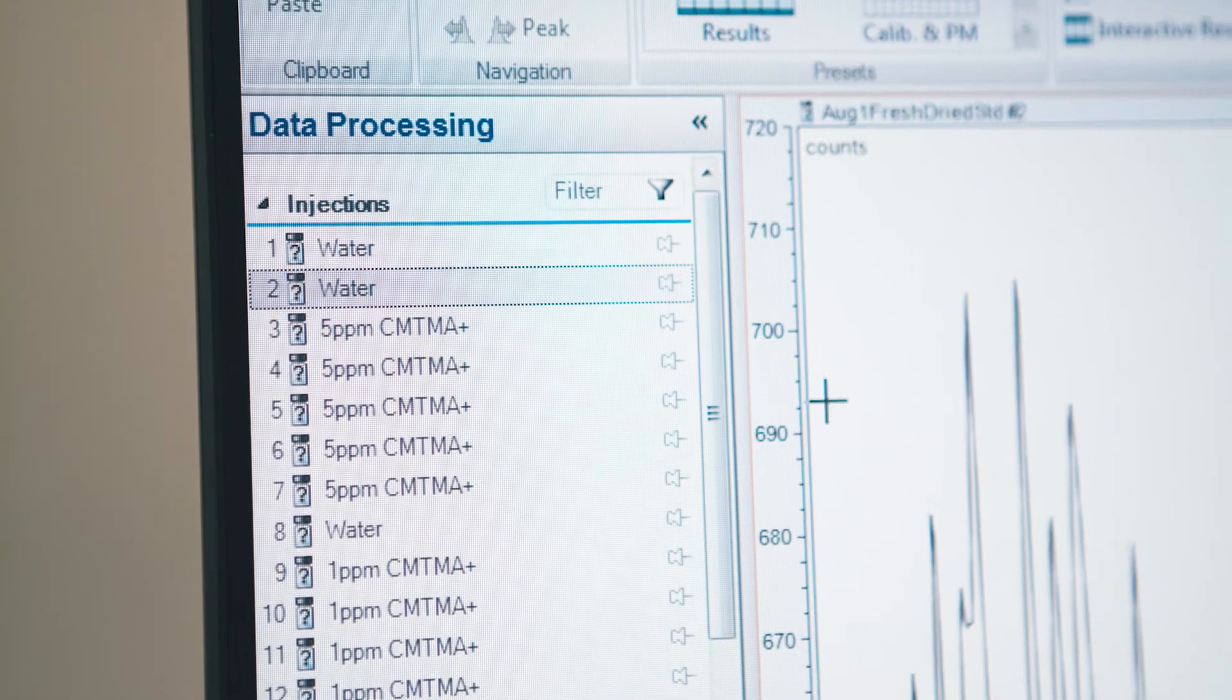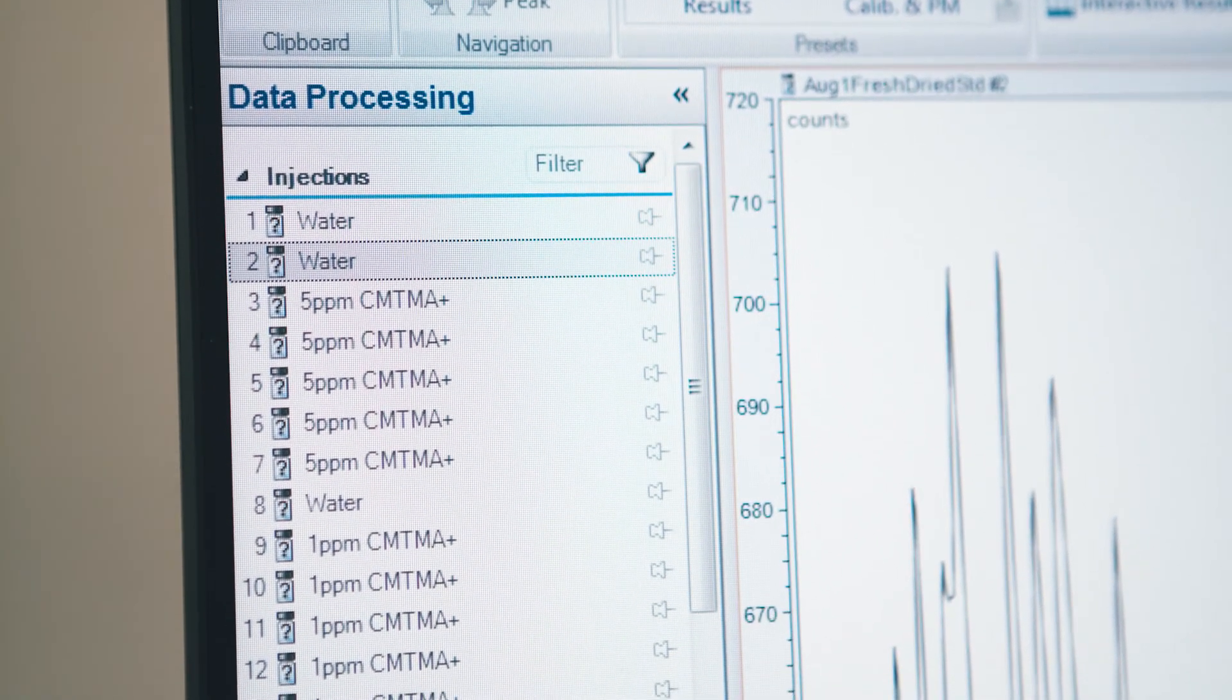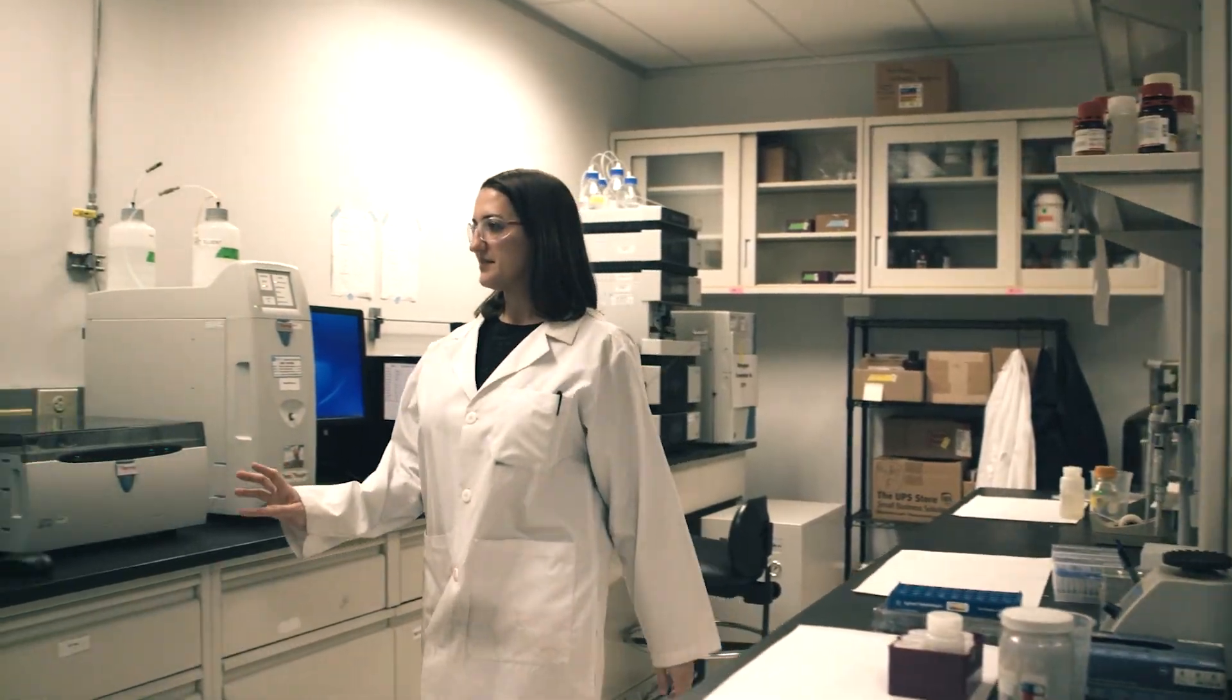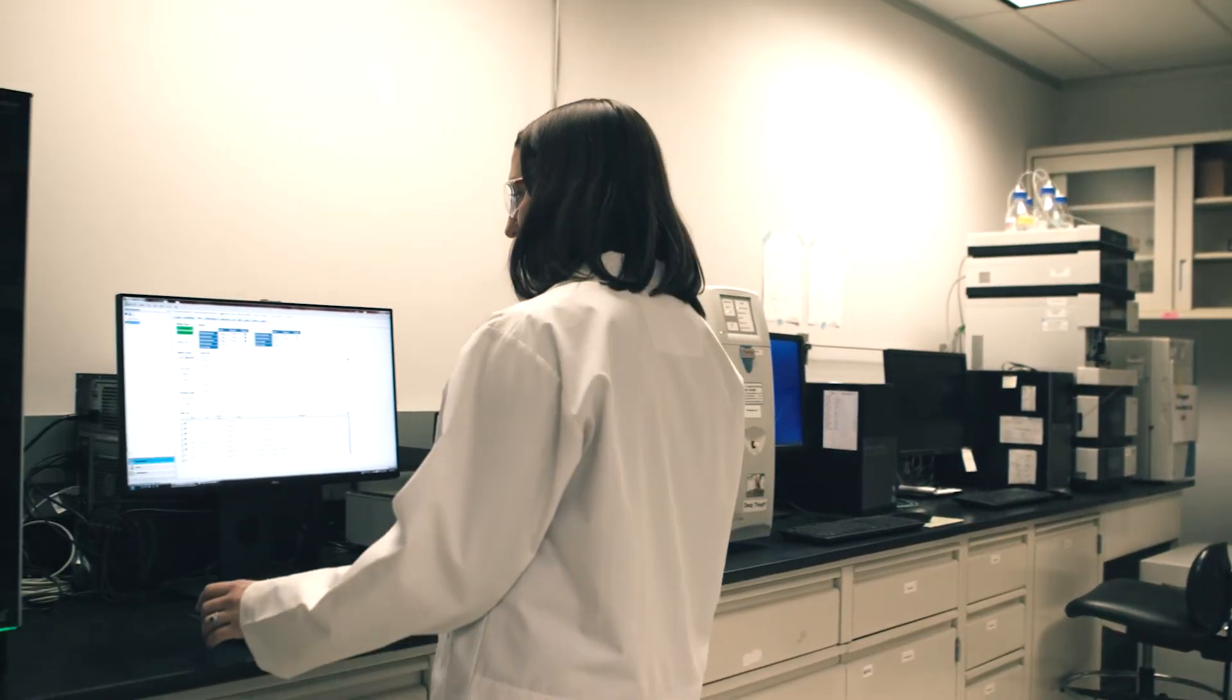The ThermoScientific Chromeleon software I use on several instruments in my lab on two different LC mass specs and my ion chromatograph. I like all the different variables that you can change and all the different data outputs, even including our company logo is on the report that I'm able to generate from the software. My end customers, they're impressed with the reports that I deliver to them.